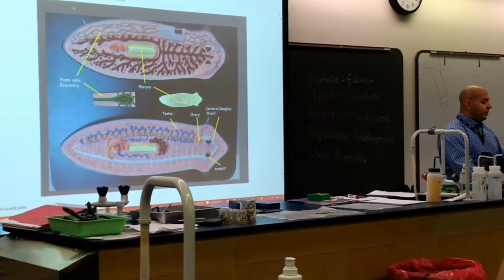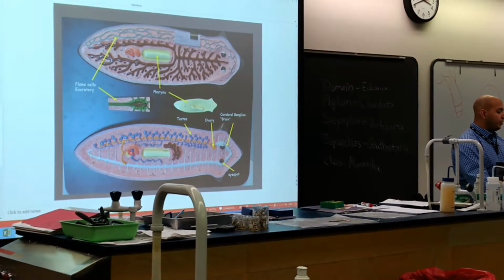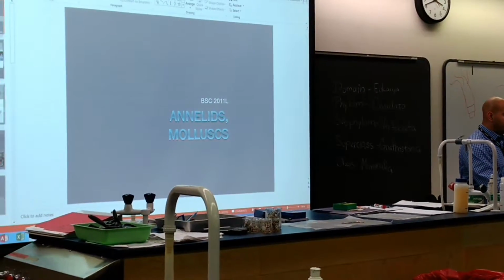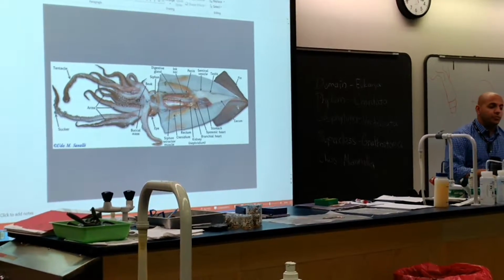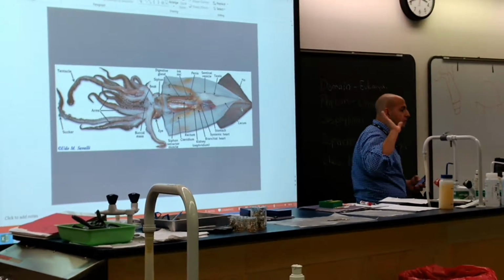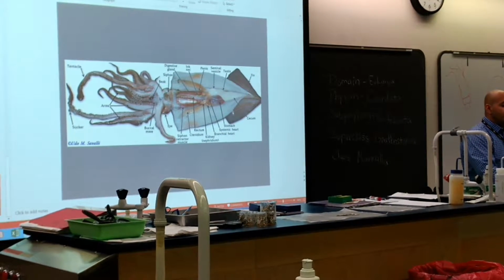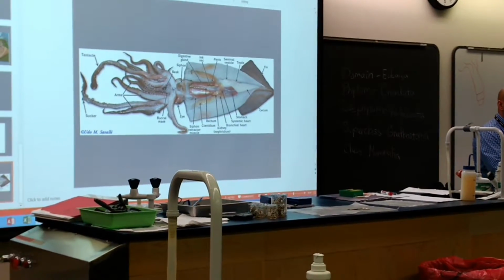So you also have your squid dissection that I want you guys to go over. I want you to be familiar with, over here. Okay. When you do your squid dissection, I want you to be familiar with the basic parts. Now, this is really detailed, but I want you to be familiar with testes or ovary. I want you to recognize all of this is going to be the visceral mass.